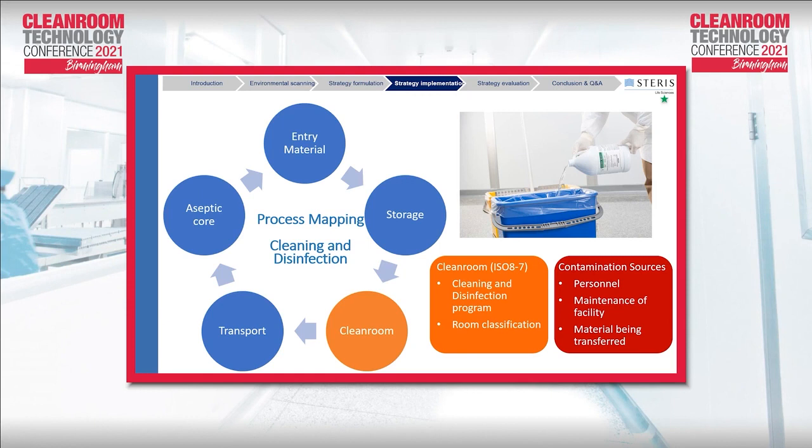The example of the BPOG will help us as a risk assessment, to look at where the most critical points are, where there is a high probability of having a contamination, and help us in justifying your cleaning and disinfection program. By that I mean the frequency of cleaning and disinfection, the type of disinfecting agent that needs to be used, etc. Of course, your historical environmental monitoring data will also help in deciding on the use of either 2 or 1 disinfectants, with a sporicide, etc.